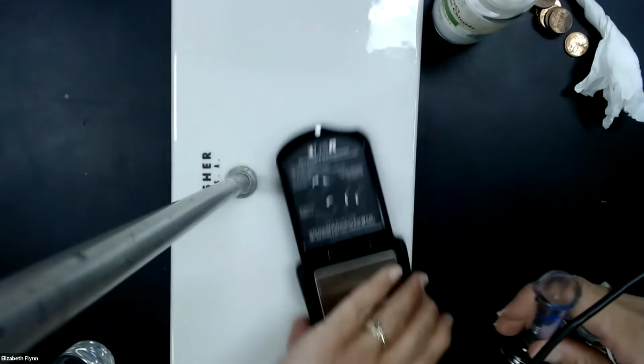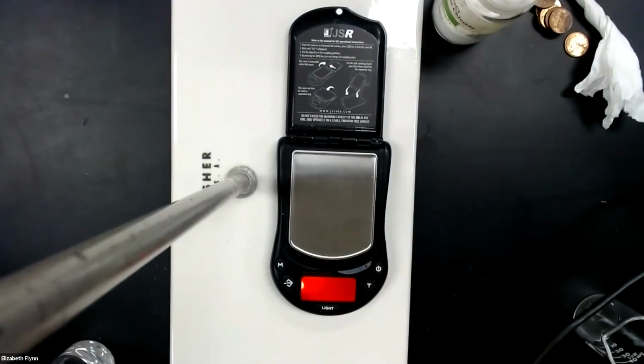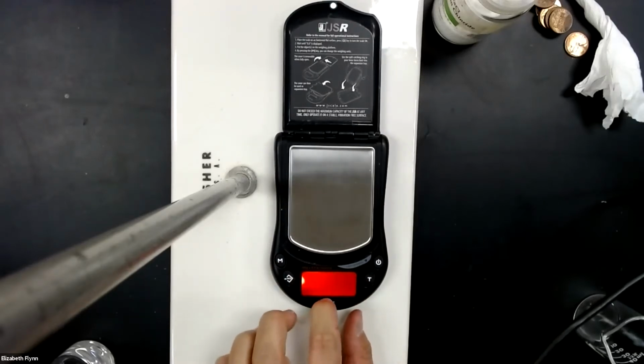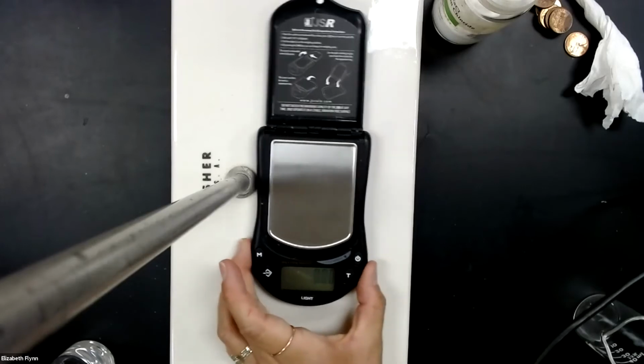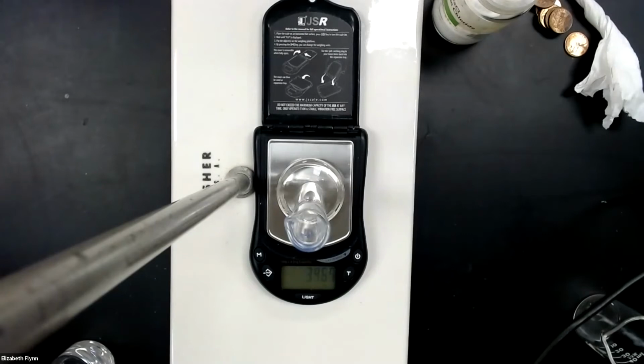Now I'm going to measure the mass of the empty graduated cylinder, turning on the balance. Letting it settle. And again, I'm going to turn off the light. I think you can see it better that way. There we go. And measure the mass of your empty graduated cylinder. So, 34.67 grams. And then it said to add about 9 milliliters of water.